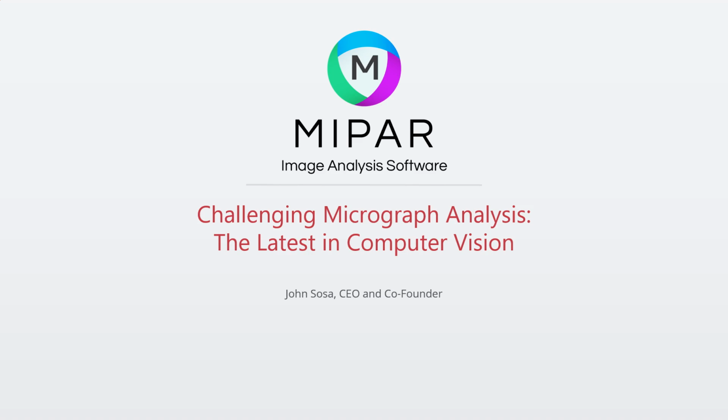Users come to MIPAR looking for practical solutions to their real image analysis problems, primarily when those problems have proved too difficult for other solutions in the past. Today we'll be taking a close look at three cases that represent many of the extreme challenges that researchers face when trying to quantify micrographs.